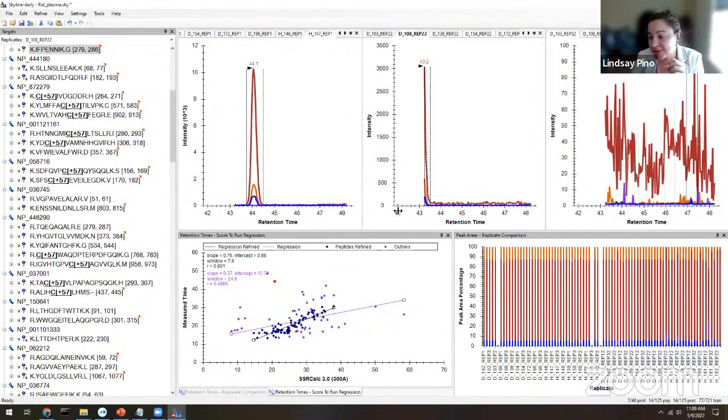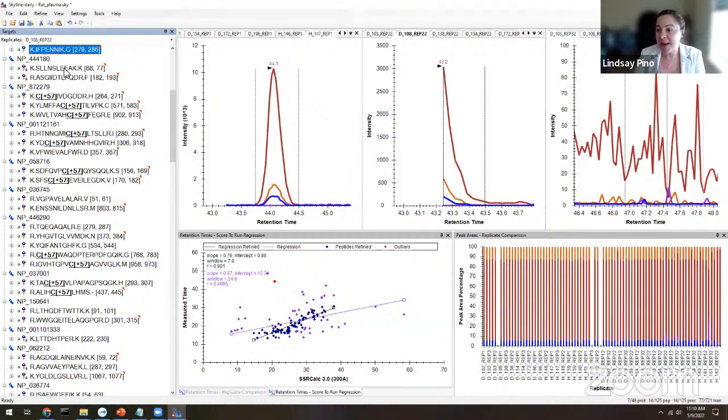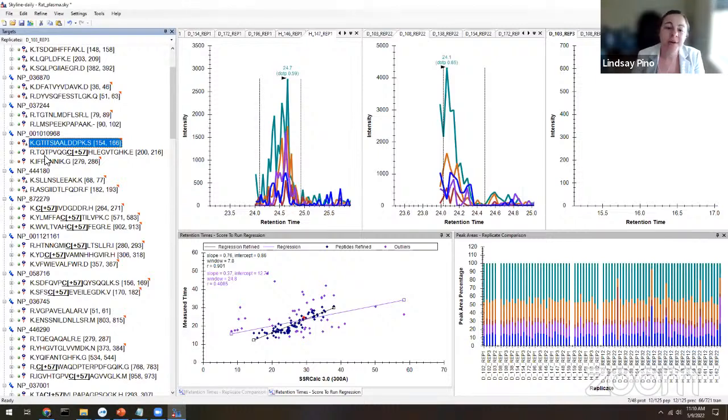If I try to push this downstream for statistical analyses, then I'm going to waste some of my multiple hypothesis correction that you'll be learning about later. I'm going to test this peptide and I know there's going to be high variability because the measurement itself has a problem. So this is why, with DIA, with anything, I would flip through every single peptide that I would want to follow up on and convince myself that it's real. At the scale of DIA, maybe that's not practical.